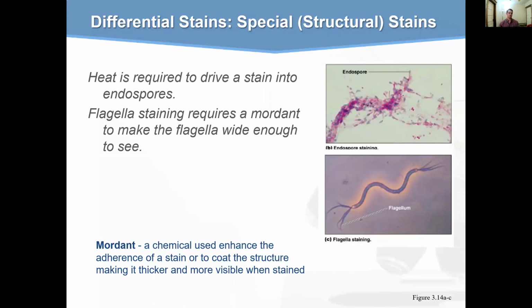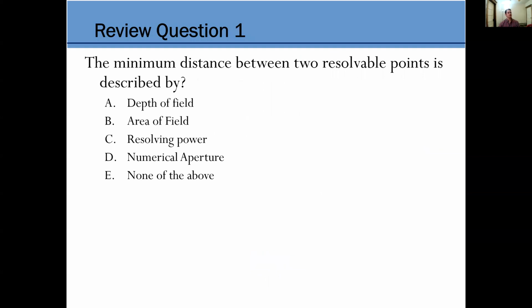More on that in our next couple of lectures. They just create an insane survivability for these organisms. So identifying which organisms are capable of producing endospores is really helpful, and we also use differential stains to do so. So today, just a couple of review questions again, as with the previous lectures.